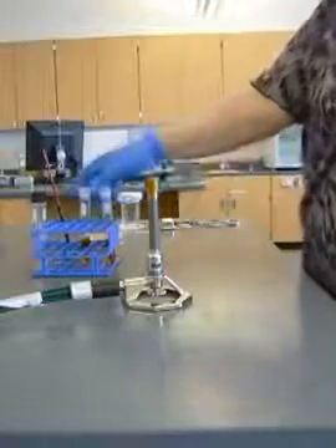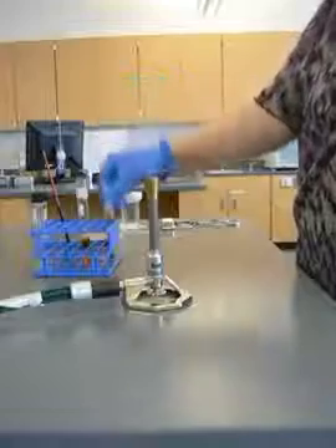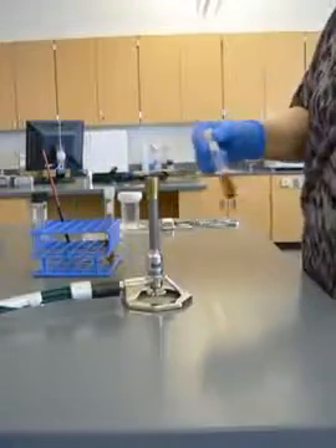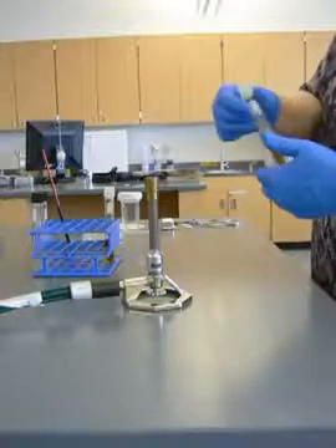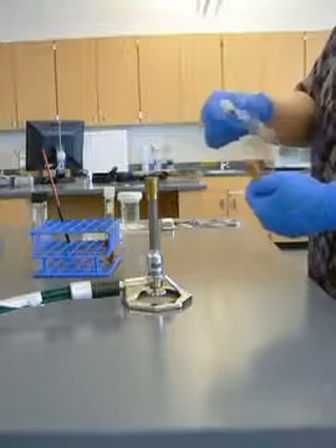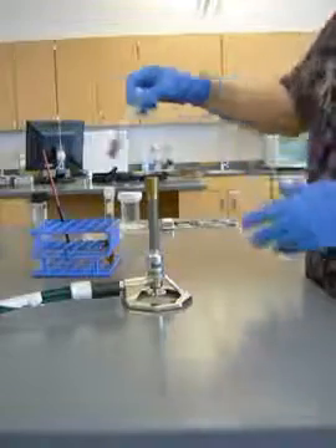I'm going to demonstrate how to pass microbes from a broth to a broth. I'm going to start out with the tube that has my microbes. I'm going to mix it up good so that my microbes are all nice and suspended. I'm going to loosen the lid a little bit.